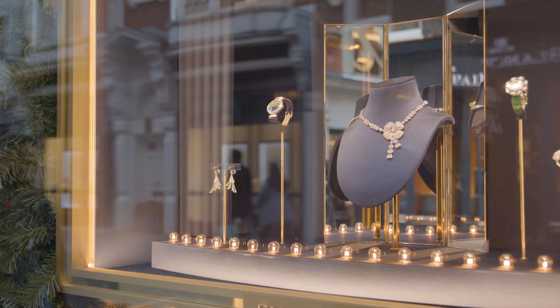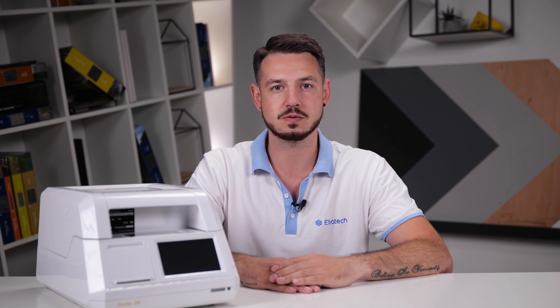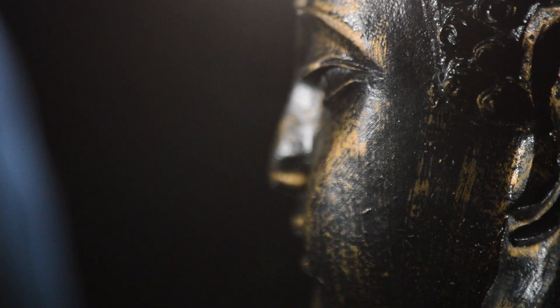Now let's move on to applications and tasks. Javelry Lab is designed to work in several key areas. Starting with jewelry analysis, this analyzer allows you to determine the chemical composition of jewelry, helping to confirm its authenticity and quality. A second important application is the analysis of precious metals — it can determine exactly which precious metals and in what quantities are present in your sample. Last but not least is analyzing antique items: Javelry Lab performs non-destructive analysis on antique items, essential to confirm their authenticity without damaging them. In addition, this analyzer has unique features such as detecting plating and non-standard alloys, determining the value of the object based on weight, grade and gold value, generating QR codes for label printing, and reading QR and barcodes with an external camera.